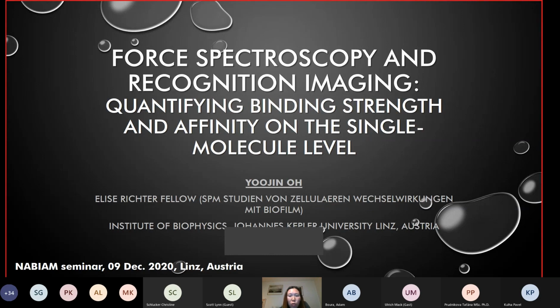I will show you how we use these AFMs, the scanning probe microscope or atomic force microscope, in our group, with a relatively lengthy introduction. I also want to bring our recent publication, how we use this AFM to quantify the binding strength and affinity on the DNA sensor.